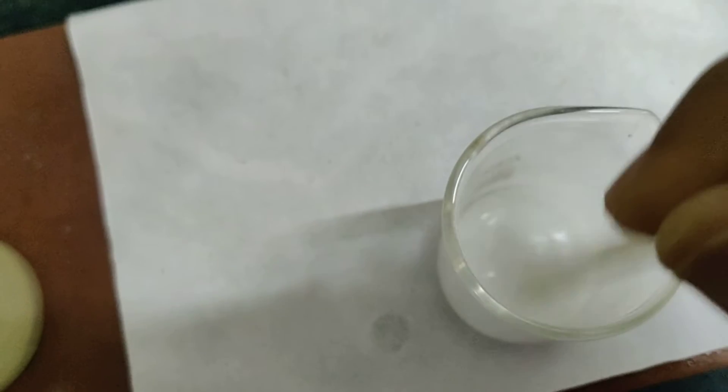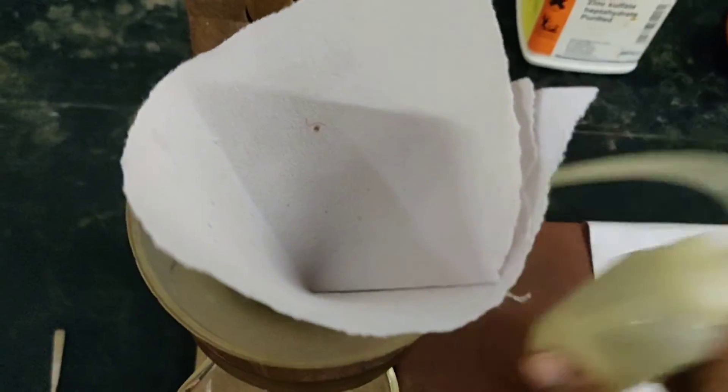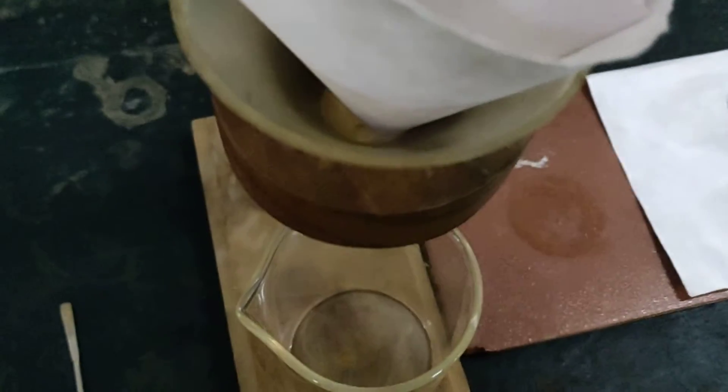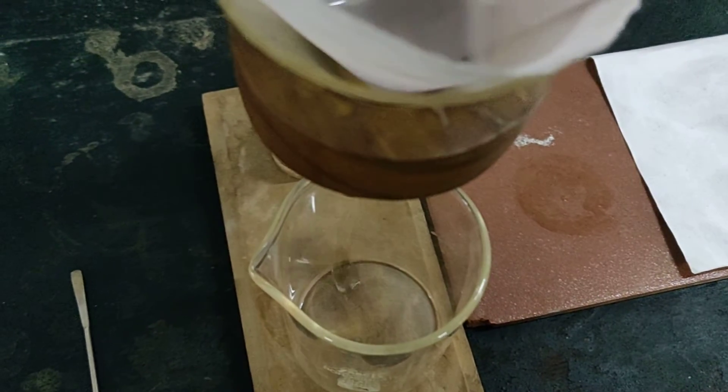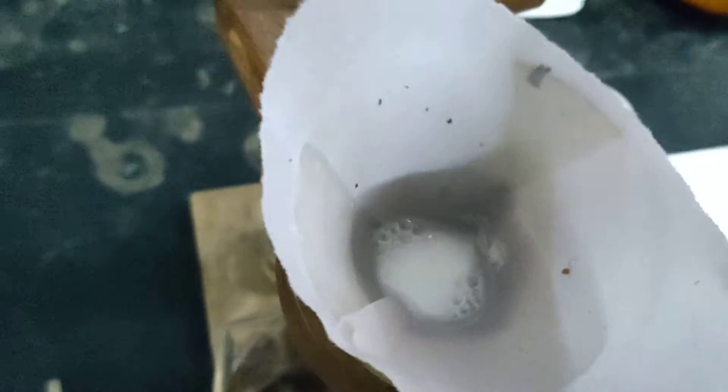Now we are supposed to filter this. For that I have kept the filtration stand ready. We have to put water and wet it first. The filter paper needs to be wetted. And now transfer the precipitate - it is complex - and filter it.